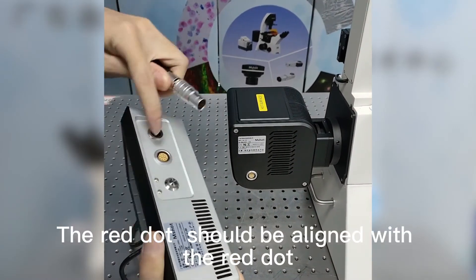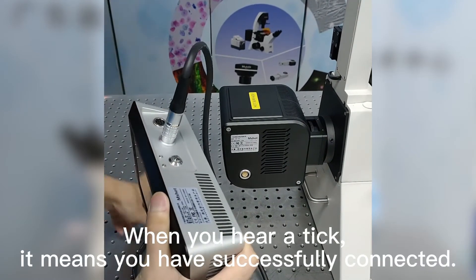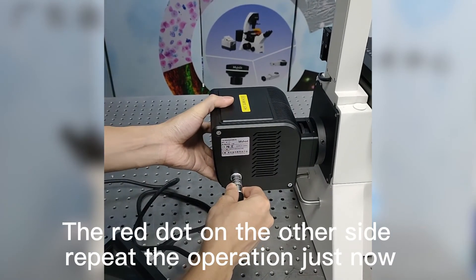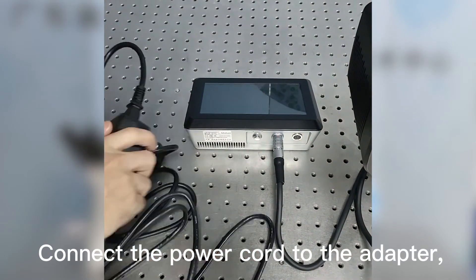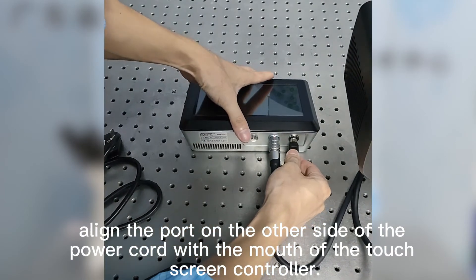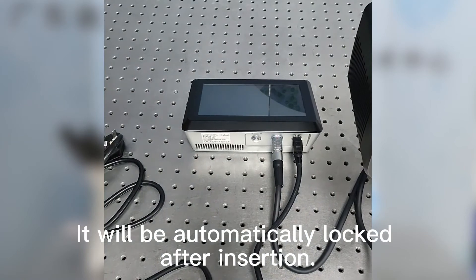The red dot should be aligned with the red dot. When you hear a tick, it means you have successfully connected it. Repeat the operation on the other side. Connect the power cord to the adapter. Align the port on the other side of the power cord with the mouth of the touchscreen controller — it will be automatically locked after insertion.